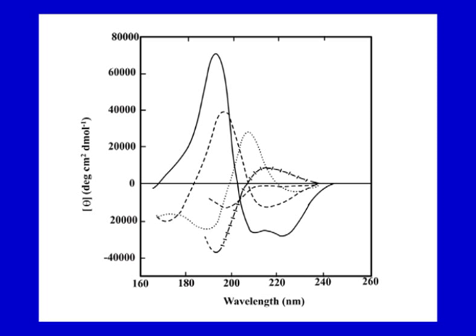So, for beta conformation, this clearly shows that beta sheets do not give a very clear absorptivity as compared to alpha helix. Then there is this curve here, which is for random structures. The dotted line gives a 310 or other kinds of structures. The cross dashed line produces 310 or other helical structures, and there is a negative peak below 200 nanometer.